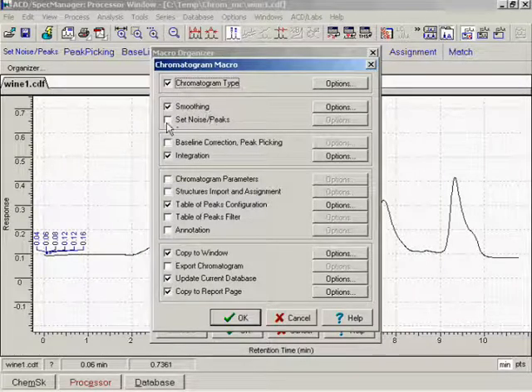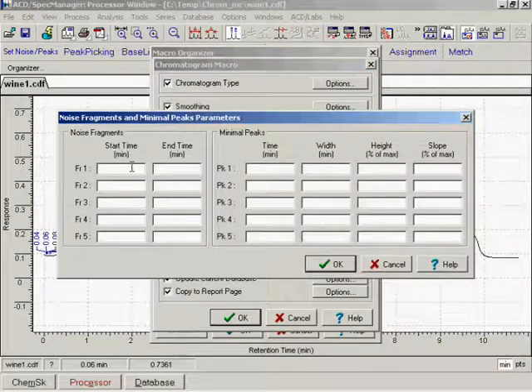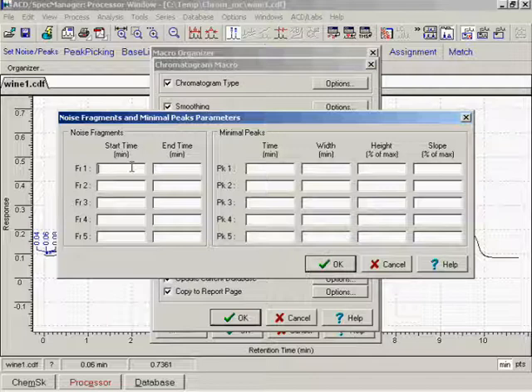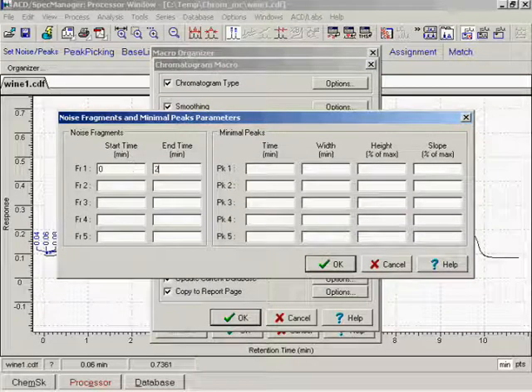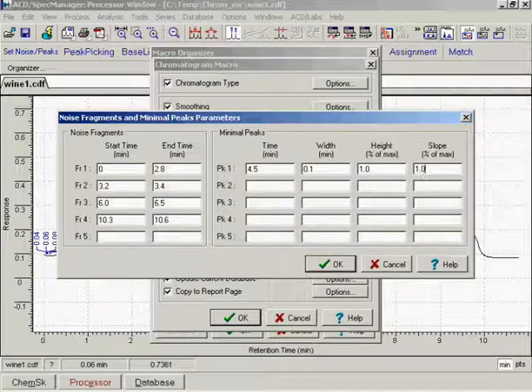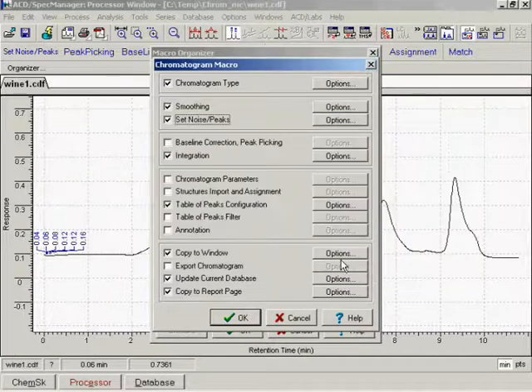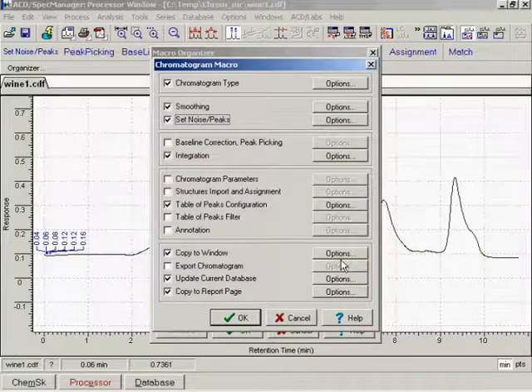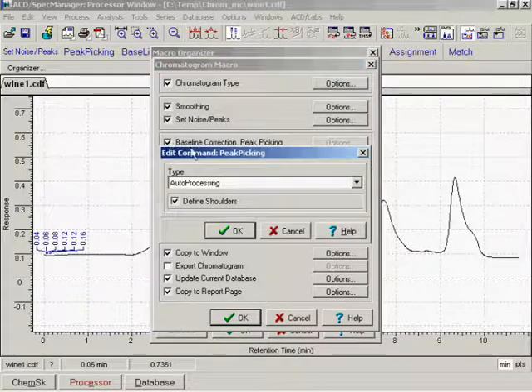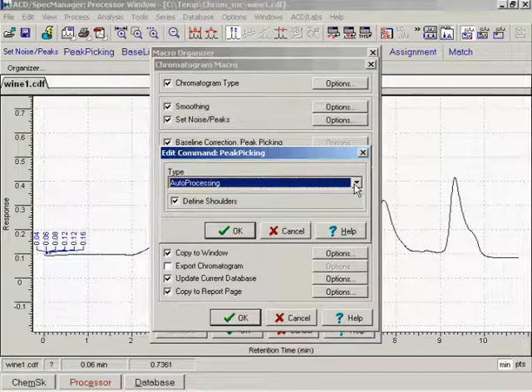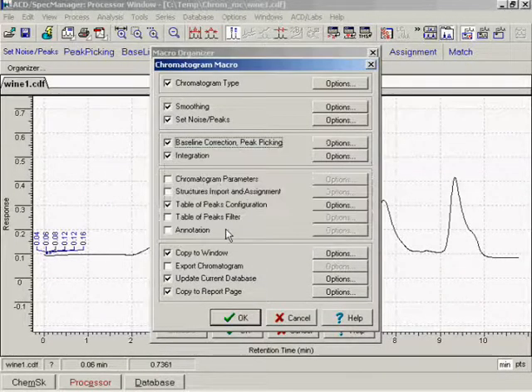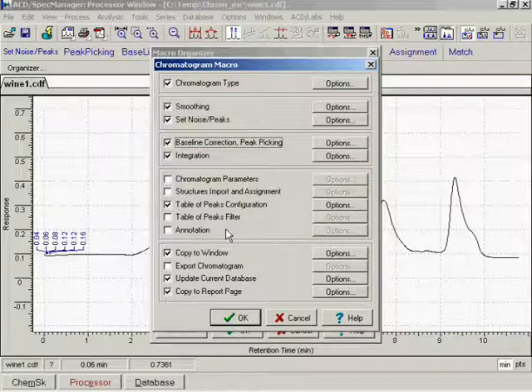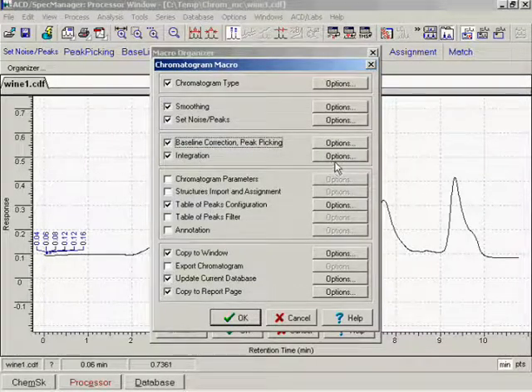Specify noise areas and the minimum size of a true peak. Set options for automatic baseline correction and peak picking. The whole chromatogram will be integrated.